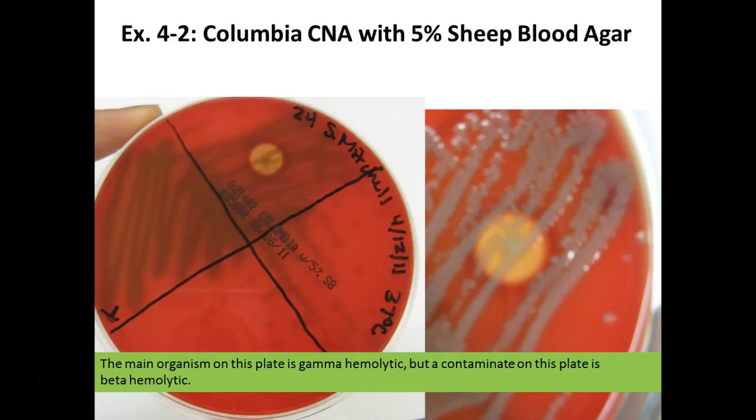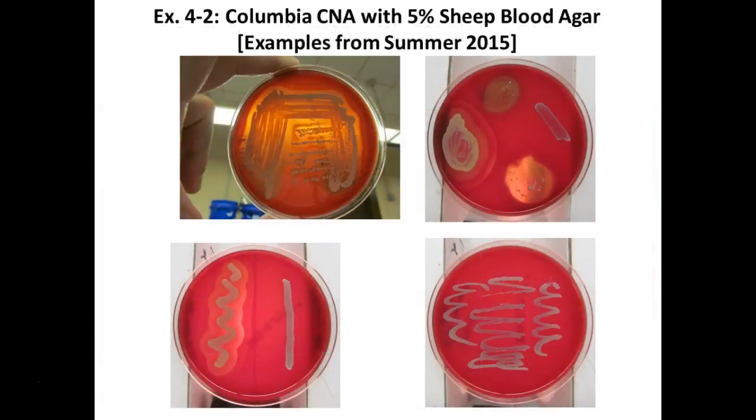Here's Staph epi, by the way, on mannitol salt. And notice how the organism will be kind of yellow, but the media doesn't turn yellow. I forgot I had this one. Go ahead and pass that one. So you see, and then over time it kind of will look like that.